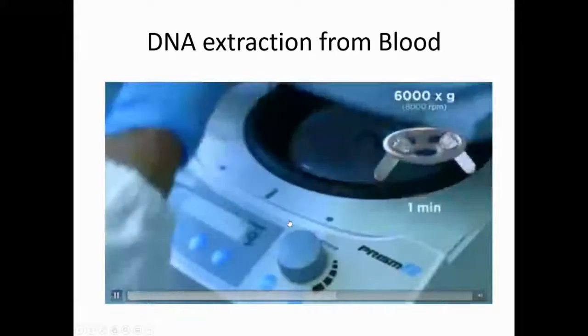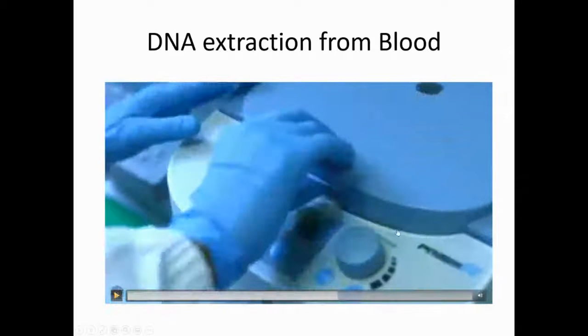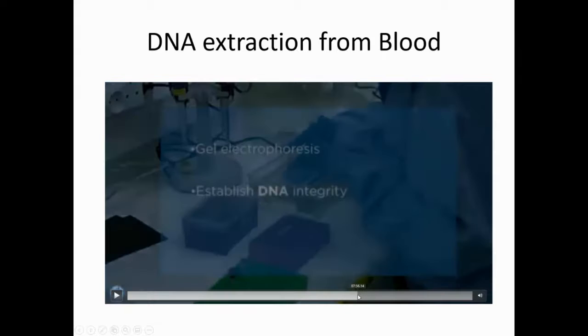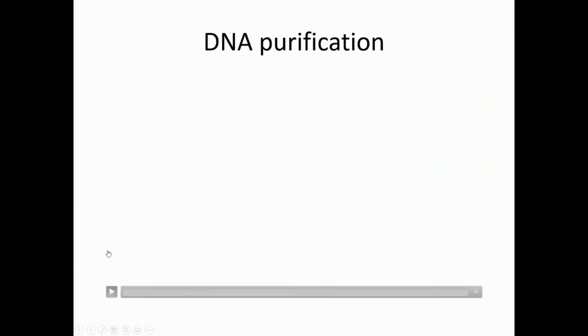This repeat elution step optimizes the DNA yield for each sample. Okay, so that's how you elute the DNA in the end. So that's the DNA extraction from the blood. And then also here's another video about DNA purification.